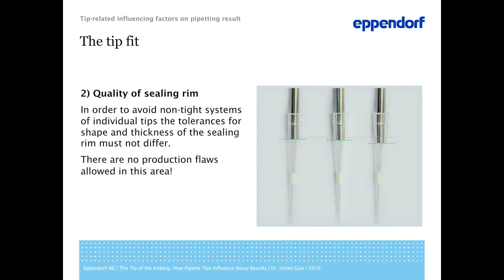If the sealing rim has a varying tip-to-tip quality, the reproducibility of the pipettings becomes affected. Some tips seal tightly on the cone while others evoke leakage. In order to visualize this situation, a testing prod with exact diameter was placed into 3 tips of one box of manufacturer G. We found the testing prod to stop at different positions, showing varying diameter of the sealing rim.